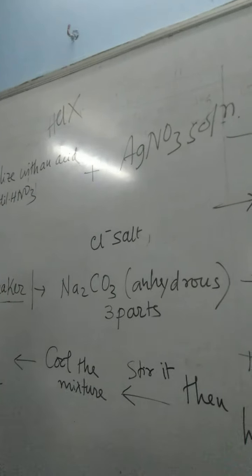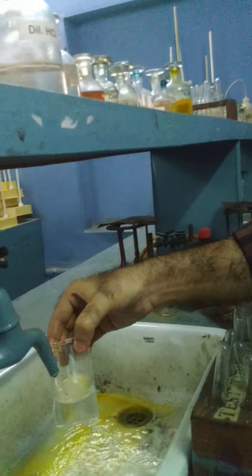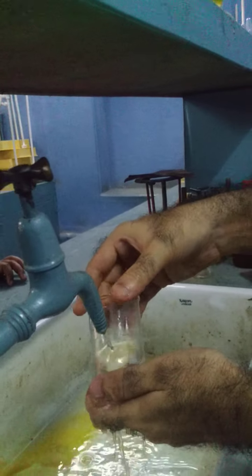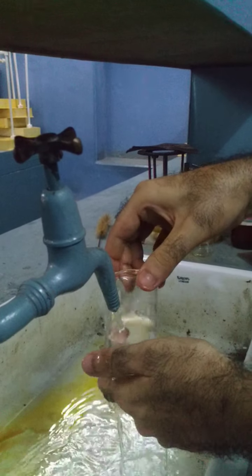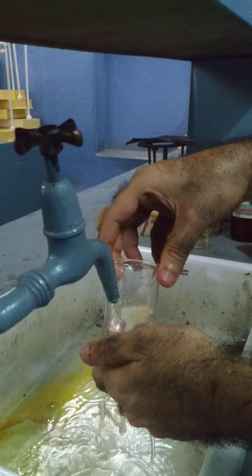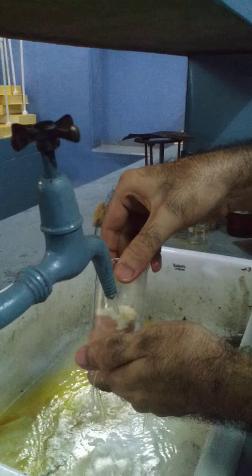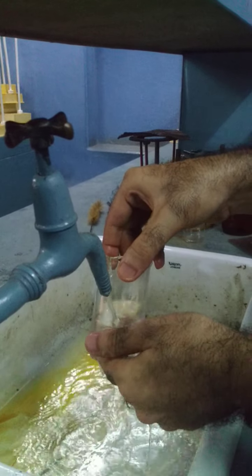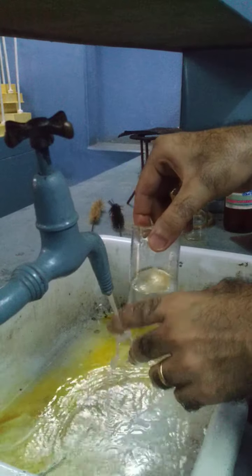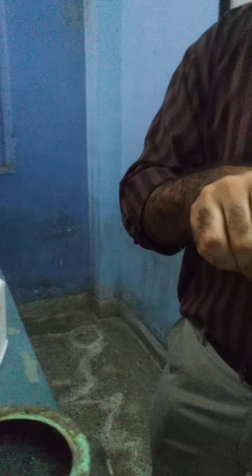You can see it's very cool. Temperature is becoming a little lower. Now I'm straight away holding this under the water to cool the solution. Lower the temperature to your tolerance level so that you can handle the solution, neither too hot nor too cold, at normal room temperature. If you do not do this also, that's not a problem, but yes, it's quite good. It's faster, so it's a pretty cool solution.